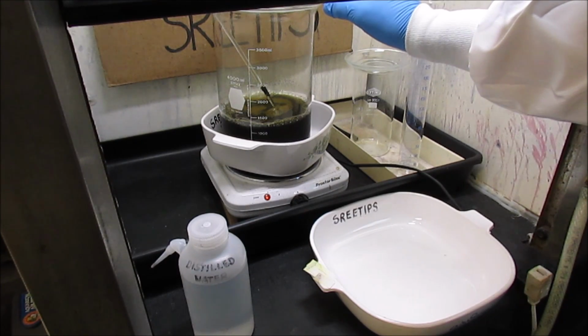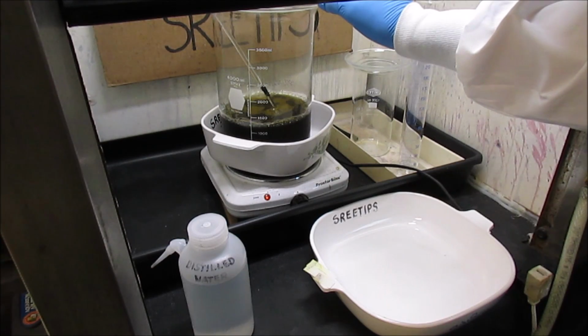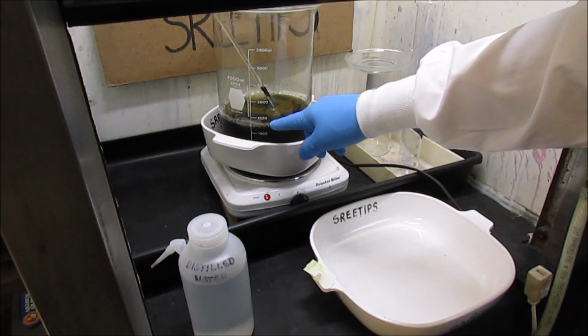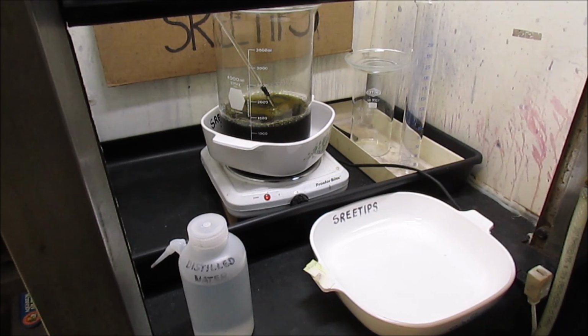Been on the heat now for about, it's like 16 hours. I've let it simmer. I've reduced the volume by a few hundred ml. I'm going to pull it off the heat now, let it cool down, and we'll retrieve the liquid and go from there.